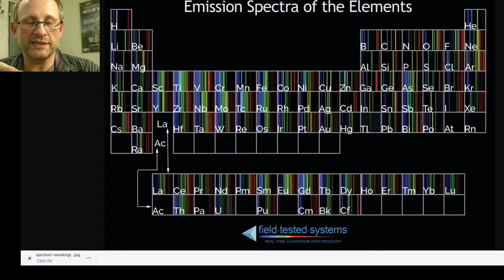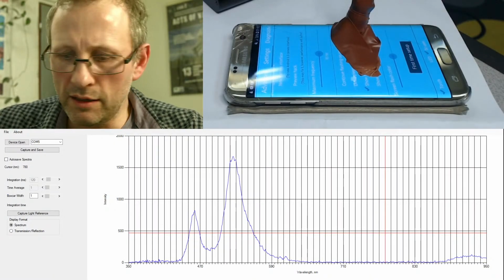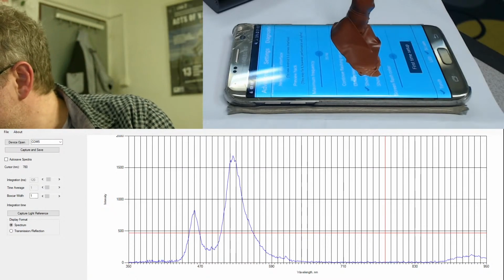And I was talking about this the other day. Yes, you can spend $10,000 on a CCD that's probably not going to be able to do as much with as much control as a second-hand 300-pound 3CCD camera from the early 2000s. So, you know, it's about thinking smart. We aren't these big labs with big budgets. And I think these kinds of solutions are very, very powerful.